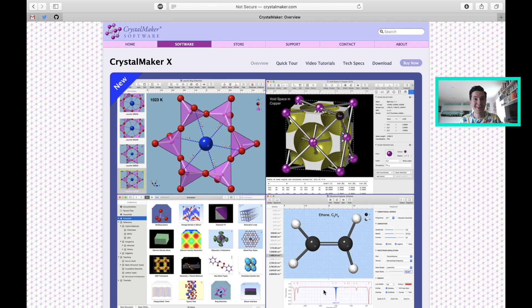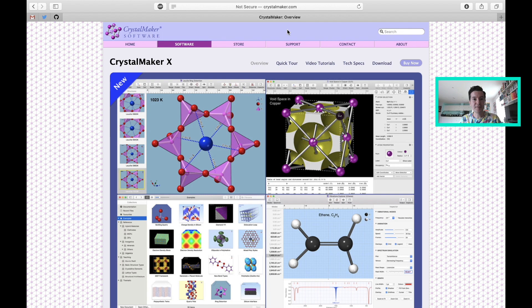Hello everybody. Today we're going to get started with crystal structure visualization. We're going to be using a package called CrystalMakerX, which is available from crystalmaker.com. CrystalMaker is a company based in Oxford — a small team of crystallographers who developed this software.